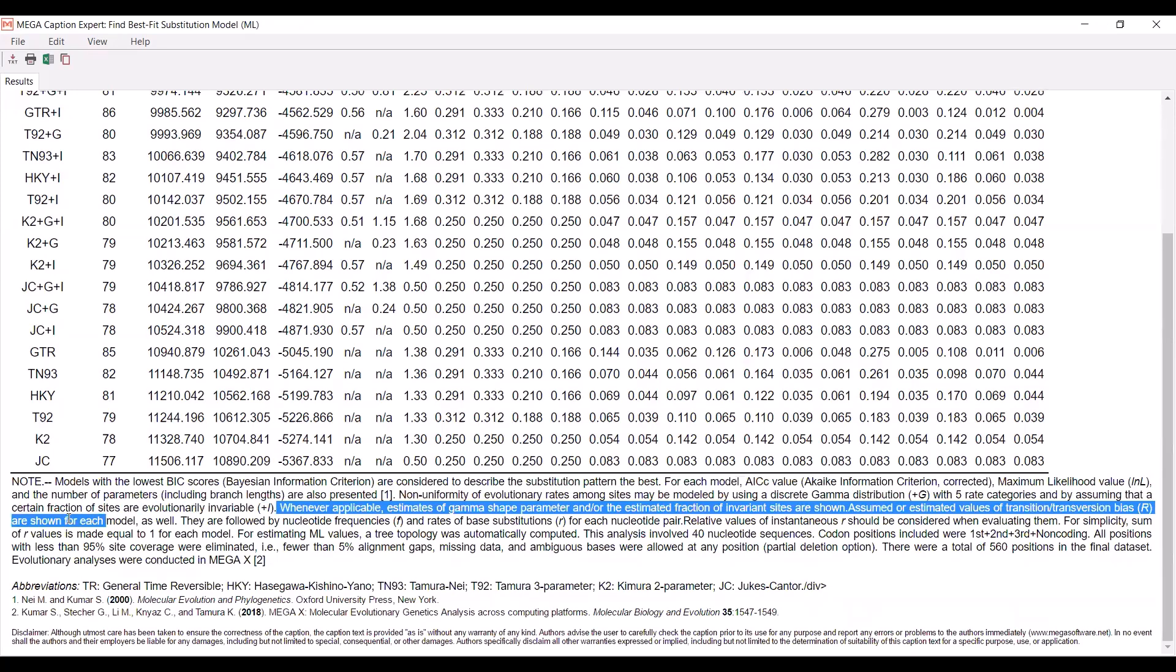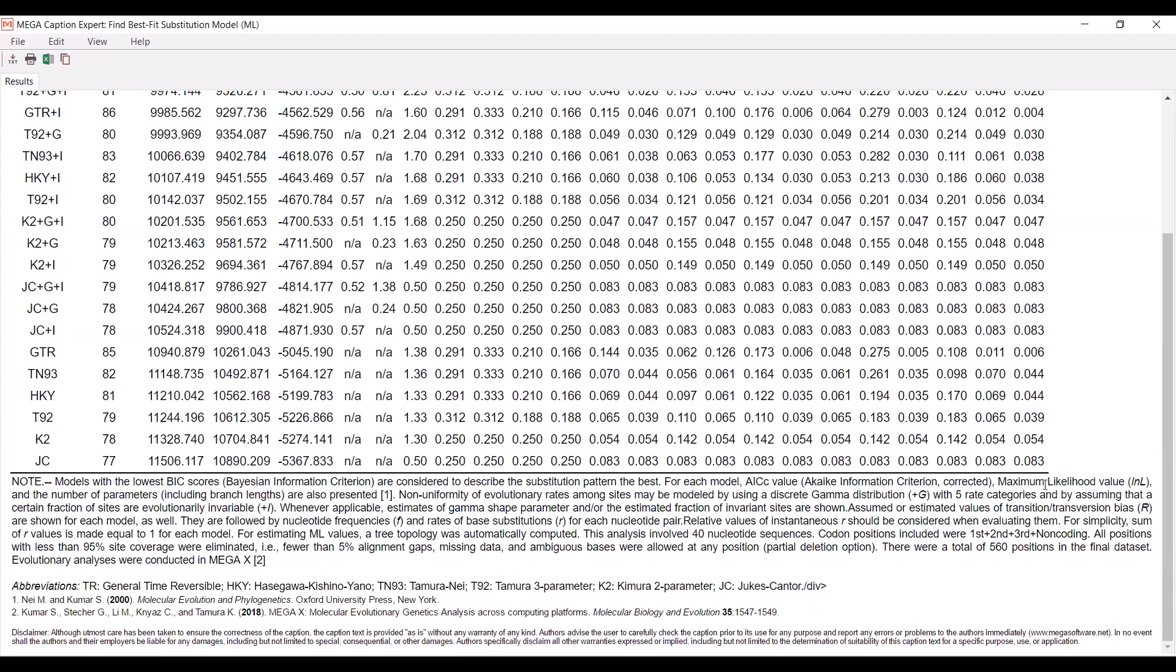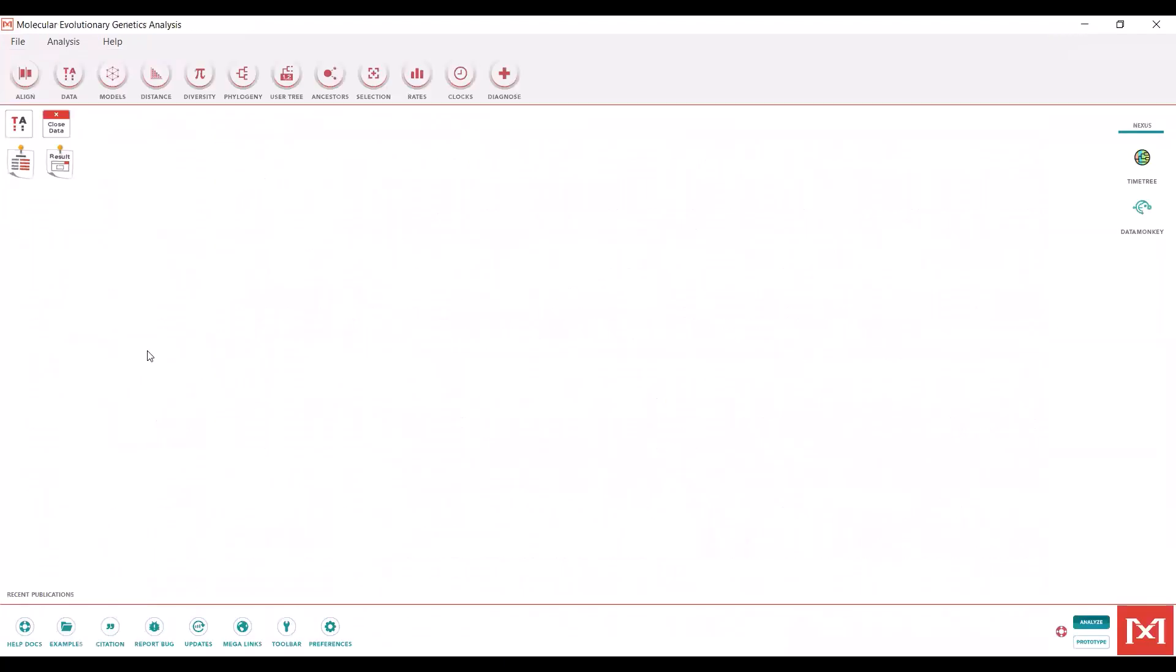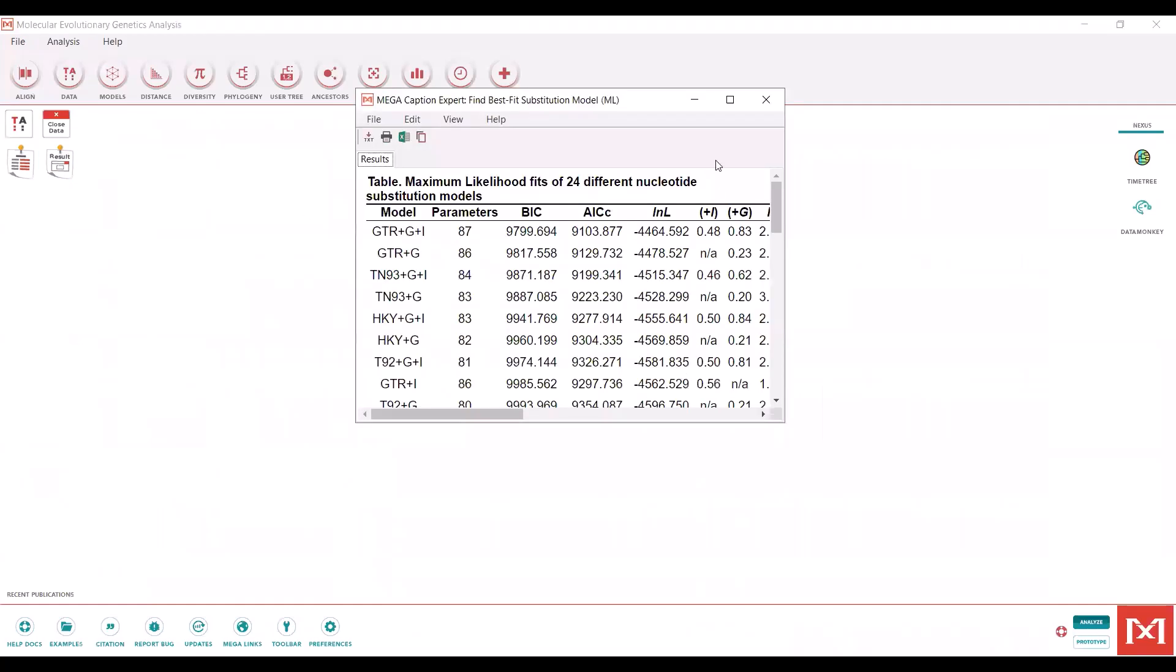You can see that the plus i parameter is given here, and the plus g parameter is given here. These are automatically sorted based on the Bayesian information criterion. So the lowest BIC number is going to be at the top. So we can minimize that. You can always pull that back up here if you need to.